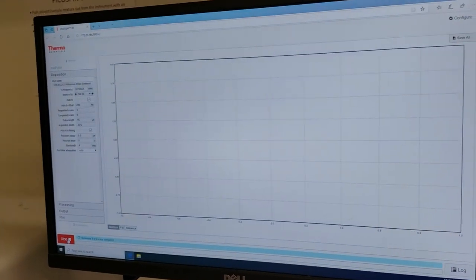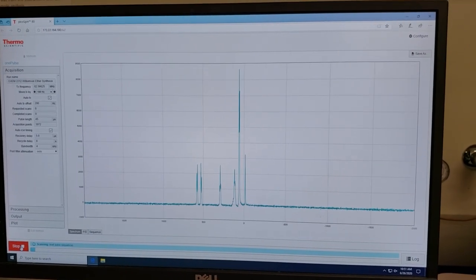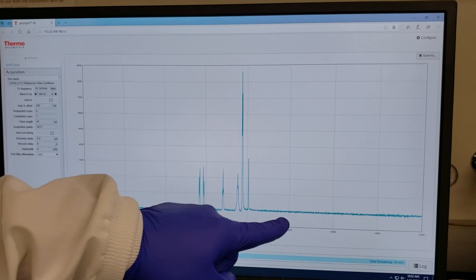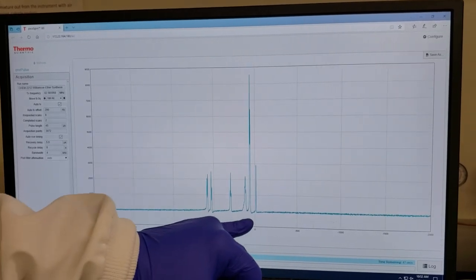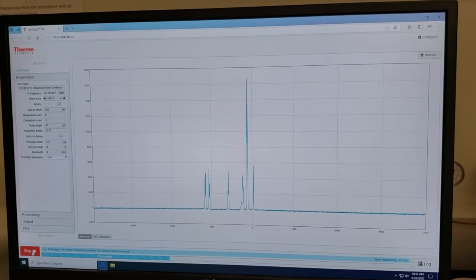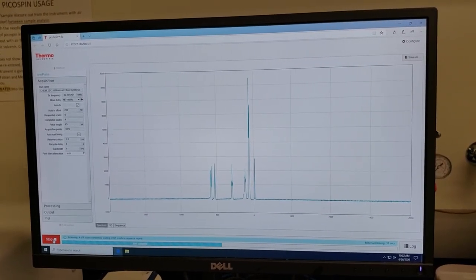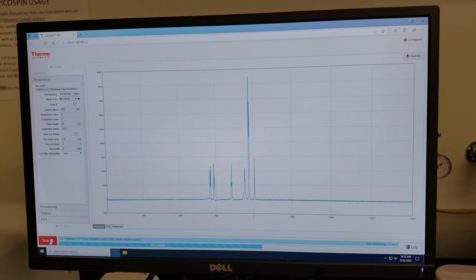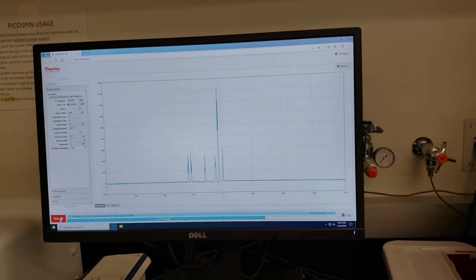Let's see what we've got. Okay. Remember that our first scan, we're at about 12% complete. The first scan is always going to be a little bit rougher. Our baseline is a little noisy. But each scan that goes through, it will refine itself, will correct some of the phasing issues, and we'll get a clearer and clearer spectrum. So far, so good. We're seeing what we expect to see. That's 75% done.